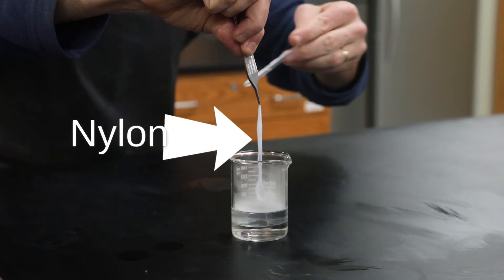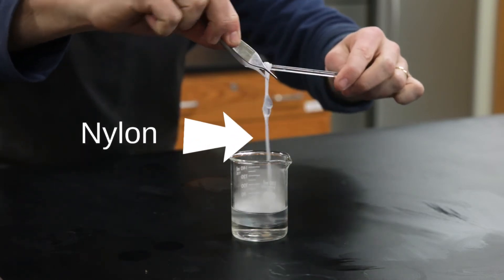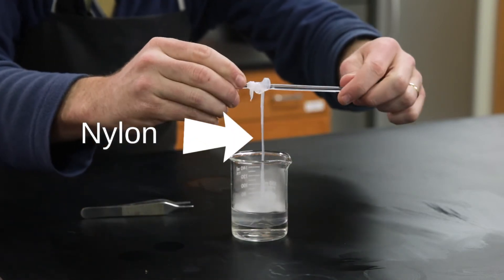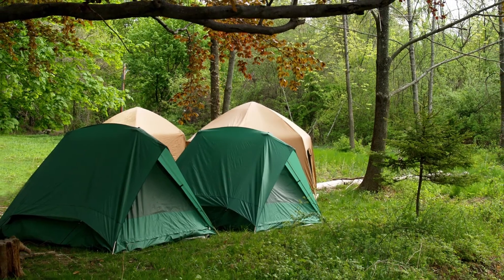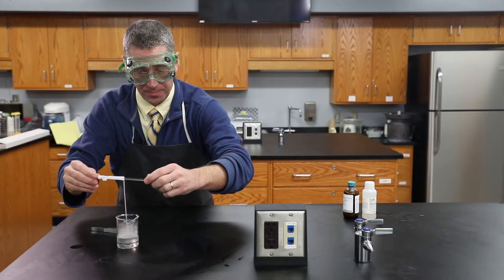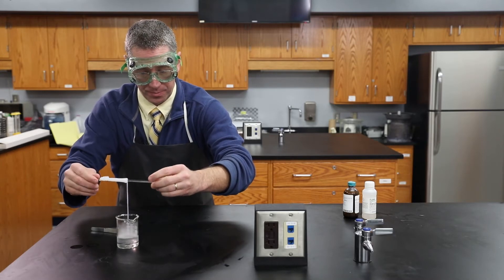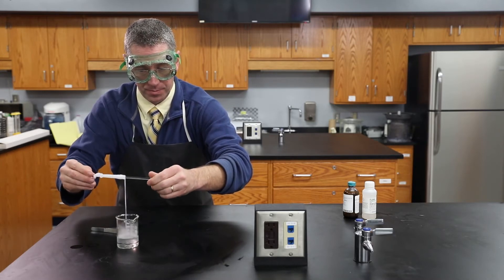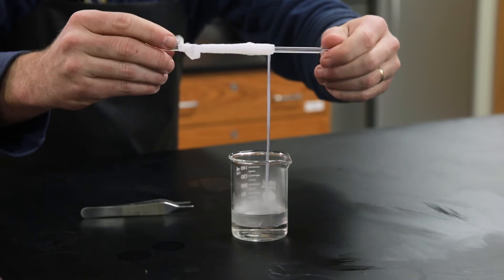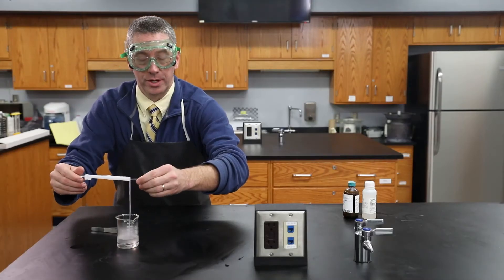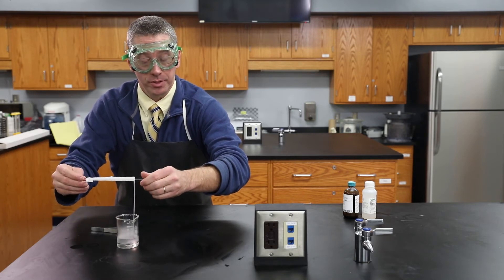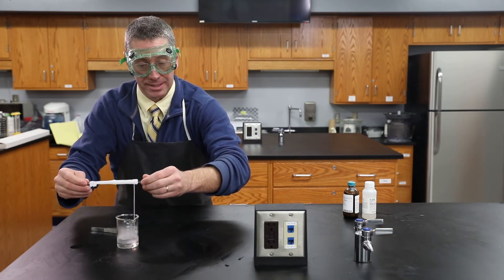Can you see the nylon that we've made? Now this is the same nylon that they make fabrics out of, tents. All you have to do is dry it, you can weave it into ropes, and you can generate an awful lot of nylon from just a few milliliters of the reactants.